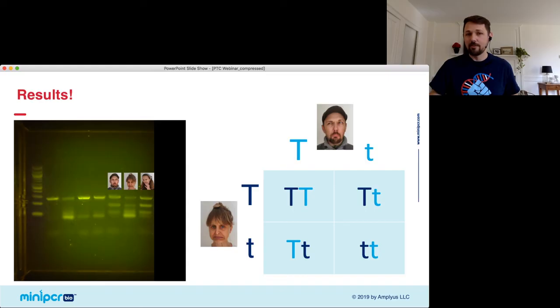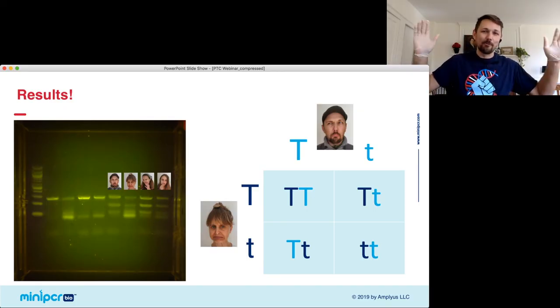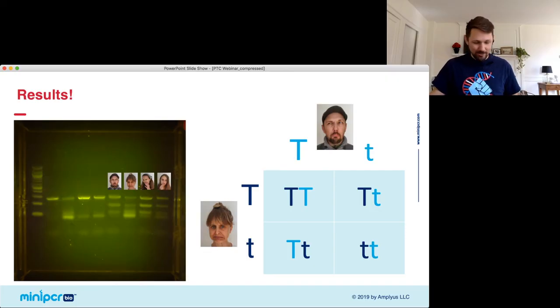And now, child number 2. All right, we are the most boring family in the world. We are a family of 4 heterozygotes. And sure enough, look at this. Either mom or dad gave her the big T on one chromosome, and either mom or dad gave her the little t. Oh, I just did that backwards. The big T would be down here. The taster got chopped in half. And on the other chromosome, she has the non-taster, which was not chopped in half.